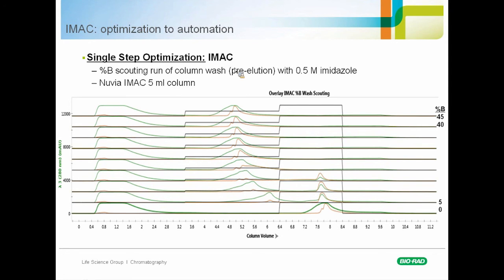So again, we know our protein peaks there, into another static loop. And again, from there, just through the binding capacity of the size exclusion column, multiple injections from the final static loop over the size exclusion column. And this just shows the data again, but showing here the recovery values at each step.